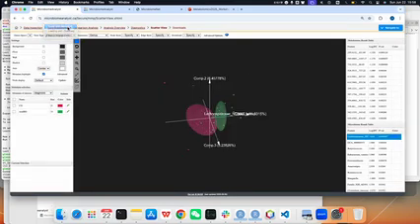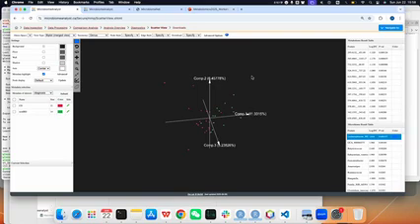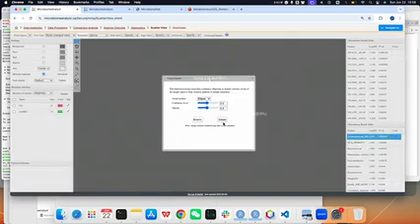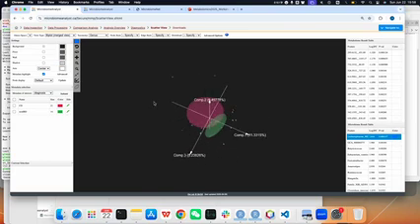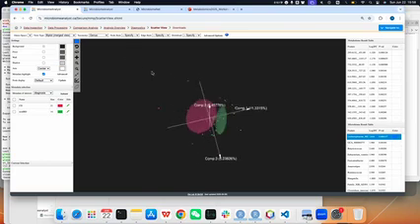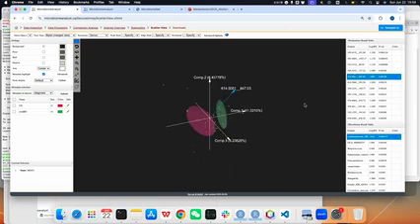Did I select it? Why is it not working? Maybe there is something wrong here. Okay, yeah, not showing up. That's fine. Can you just click some of the arrows from the top left panel? And can you see that? You mean this? Yeah, for sure. So you can select the features to view how they drive the different components.